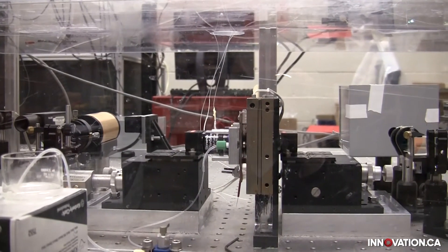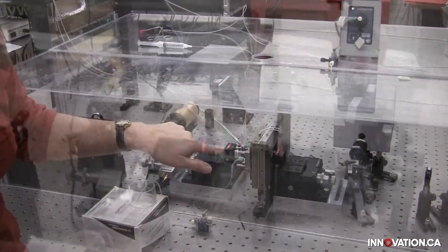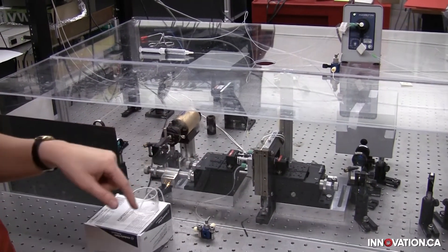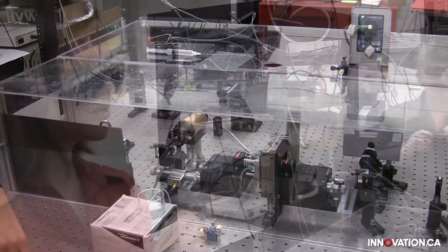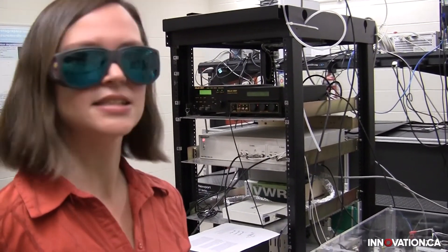So what we have here is our single beam optical tweezers instrument. It is used by our graduate students to do their experiments. This is used for stretching through the molecules and learning about their mechanics and elasticity.